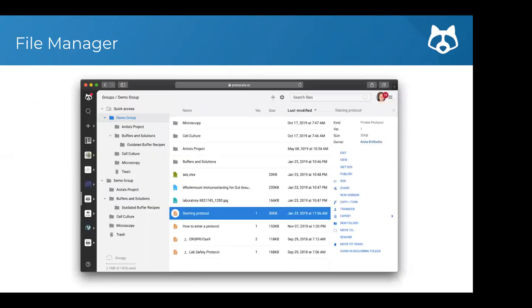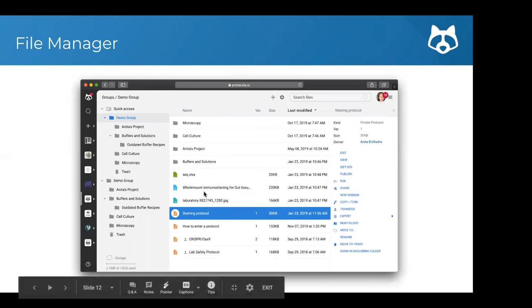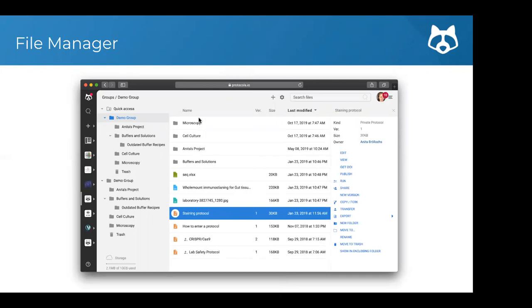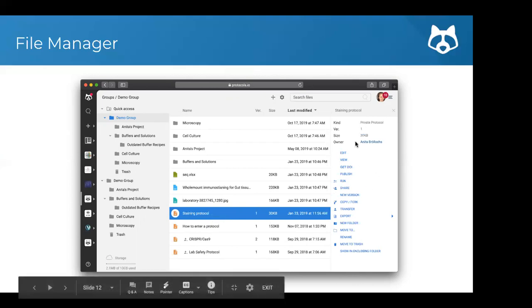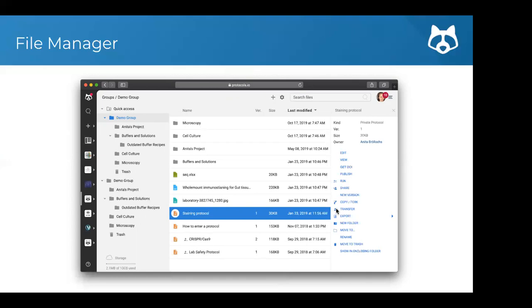Here's a quick look inside the file manager. As mentioned, you have all your protocols but can also add any other files. You can use a folder structure to organize things however you want — by project, team, or person. If you click on something, a right-hand side panel opens up allowing you to perform all the commands you might need: transfer ownership, export, run, share, create a new version, and all these things.